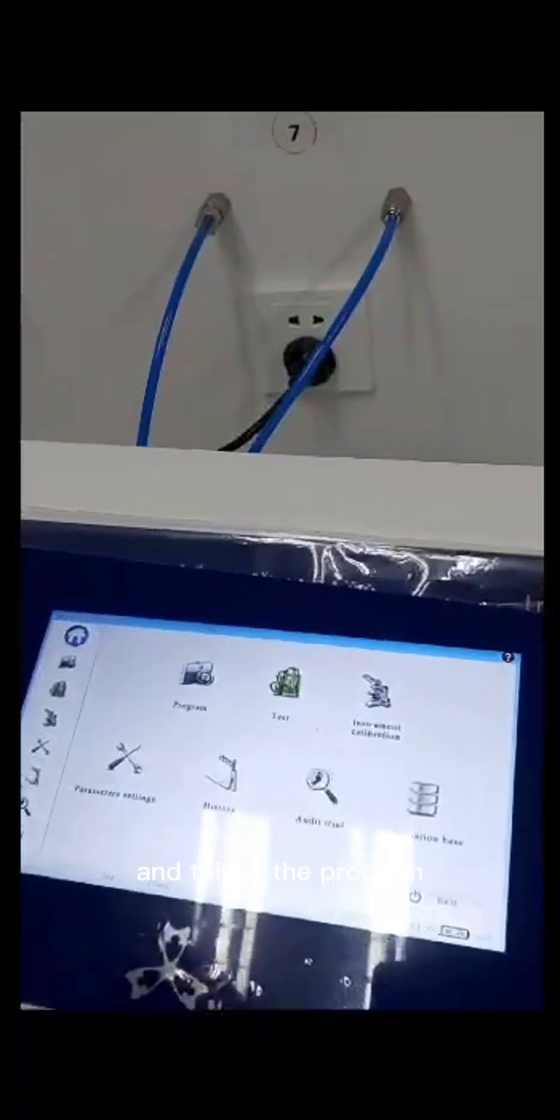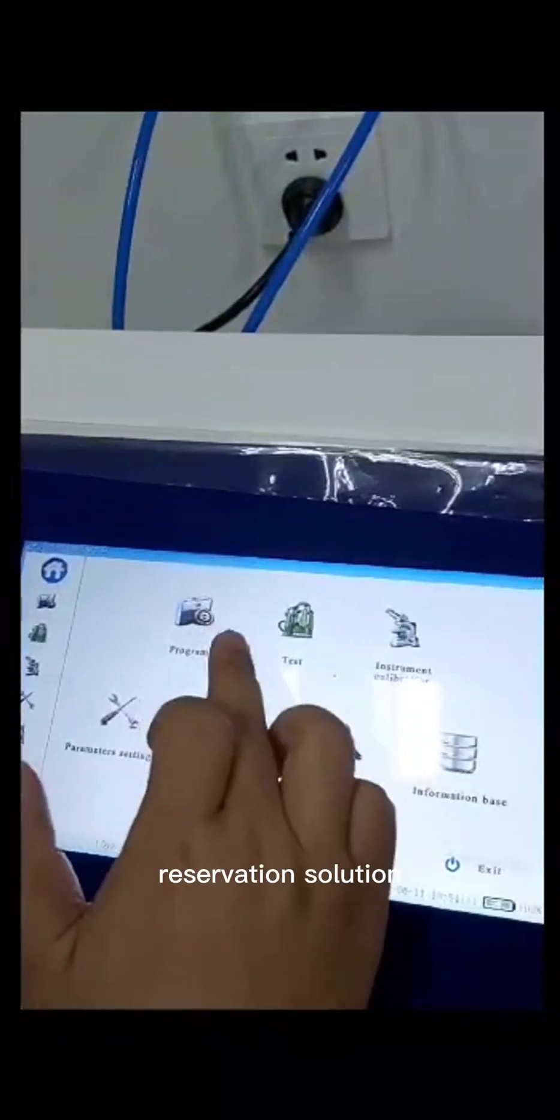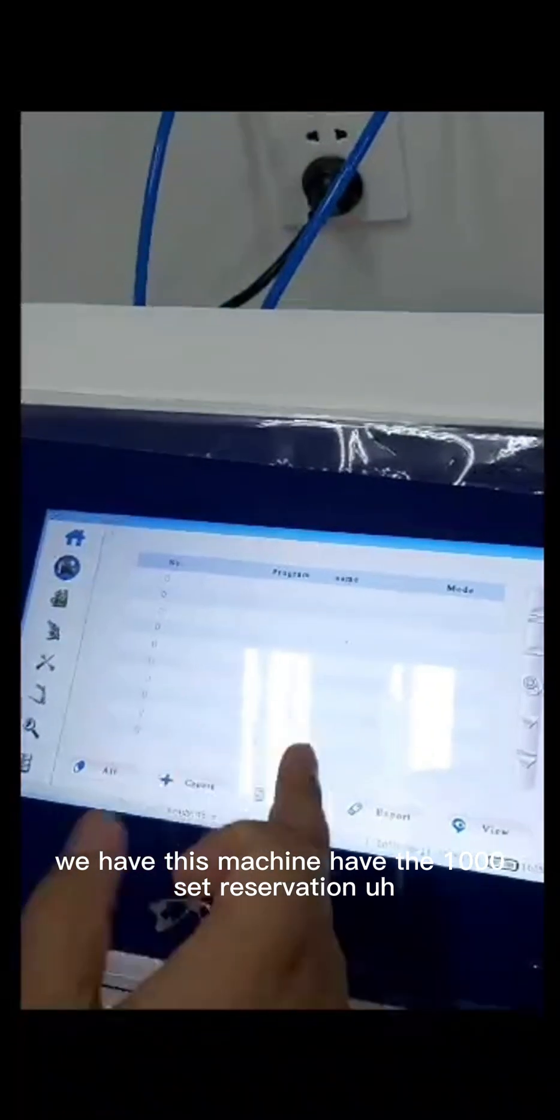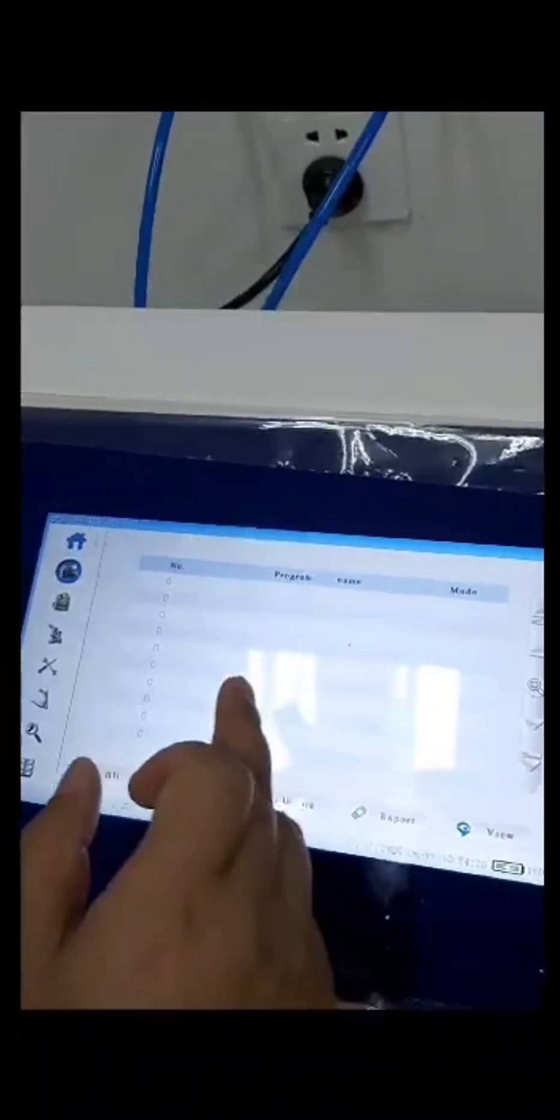And this is the program. The program is reservation solution. We have this machine have the 1,000 set reservation solution.